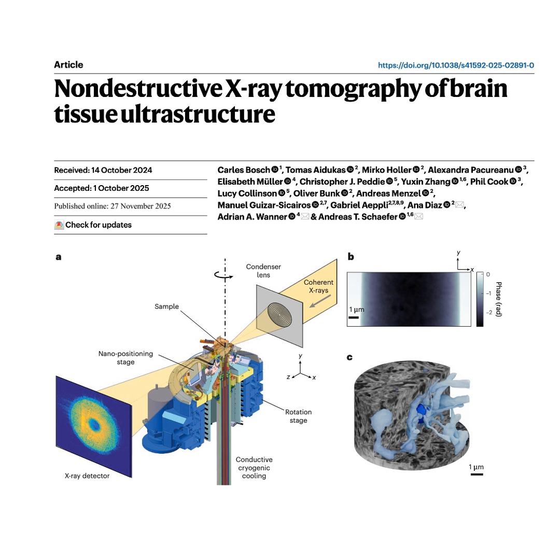And they needed to push orders of magnitude beyond that. Okay, so problem number 1 is structural integrity. The sample needs a suit of armor to withstand the X-ray fire. A perfect analogy. Which brings us to the first pillar of this breakthrough, the chemical solution.